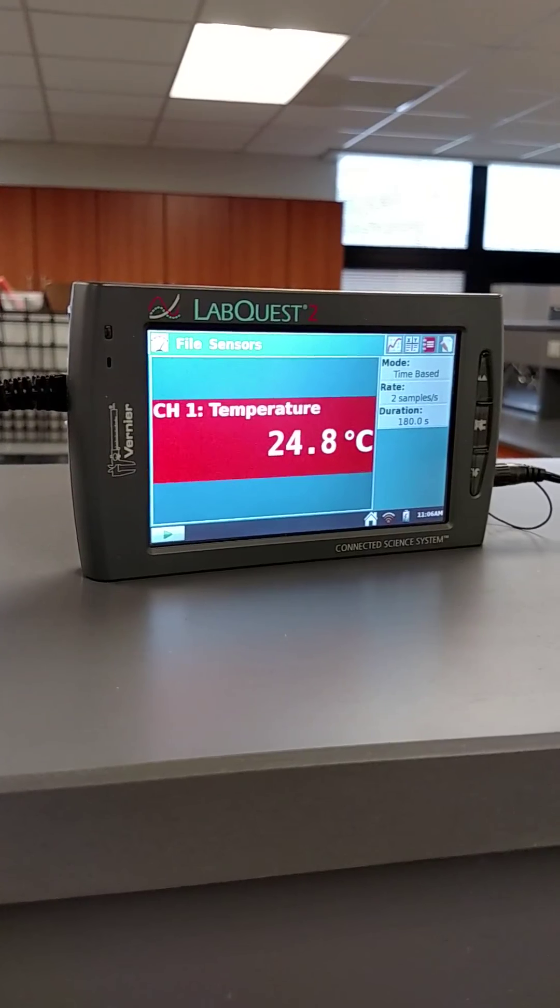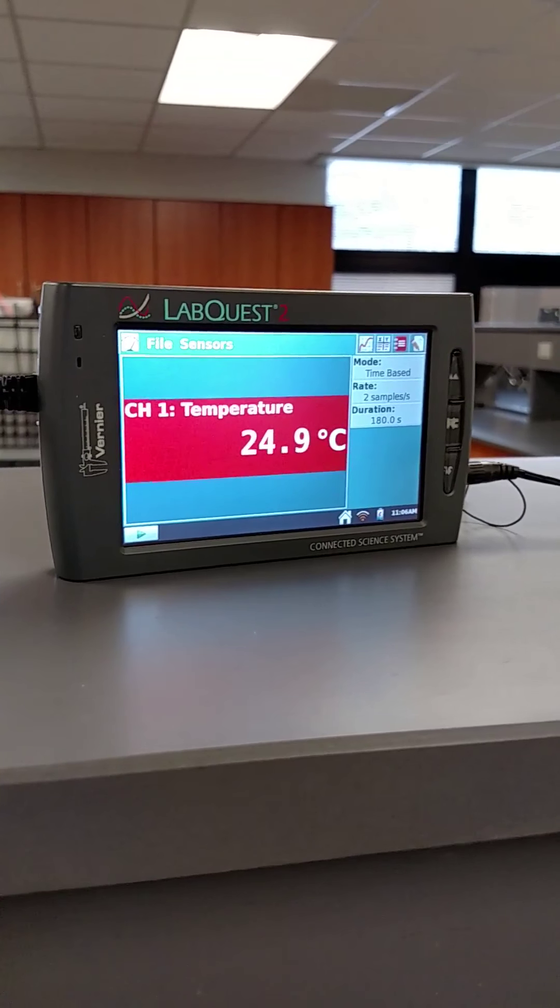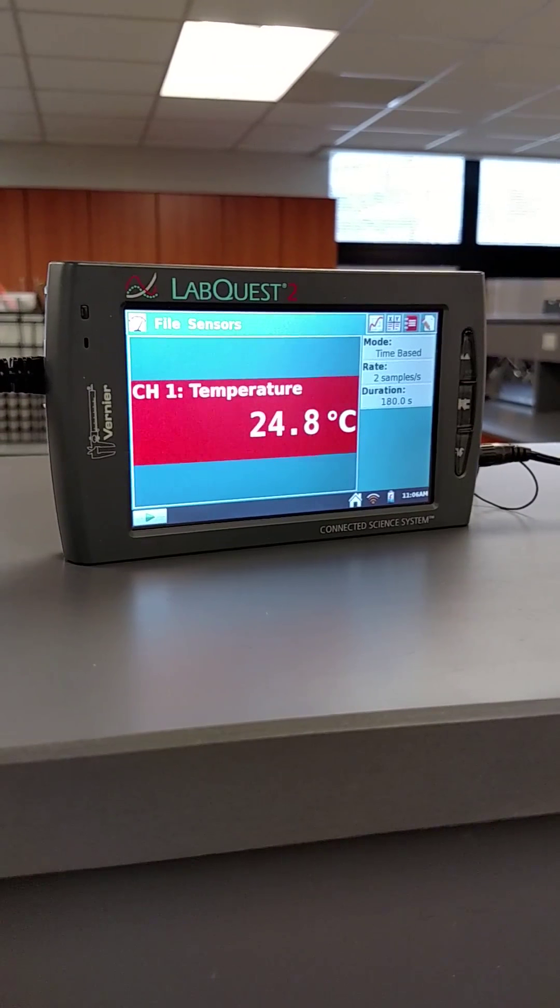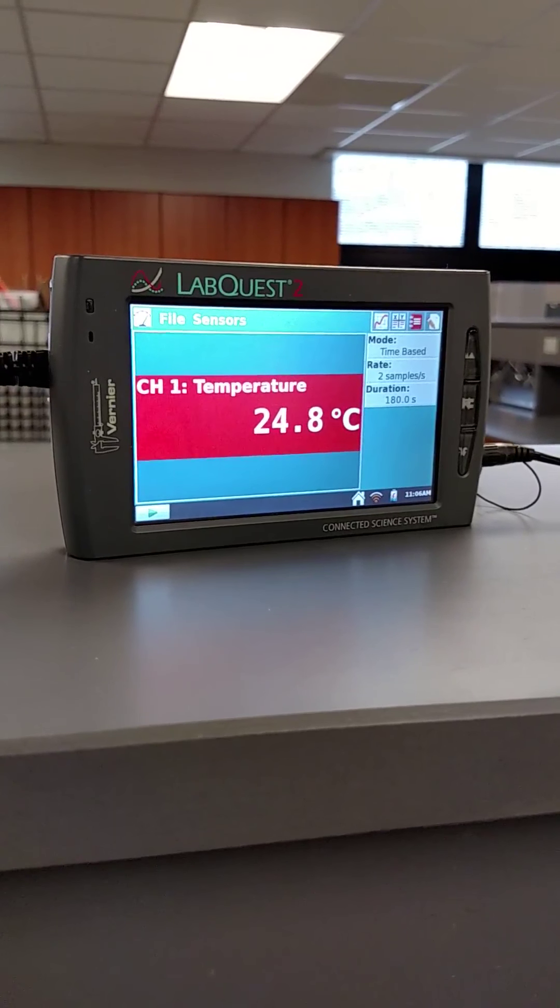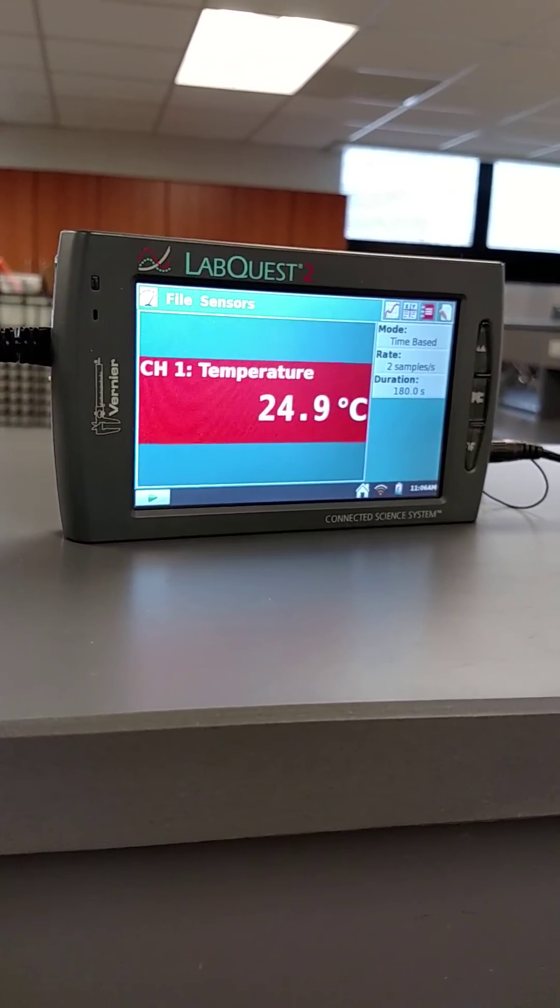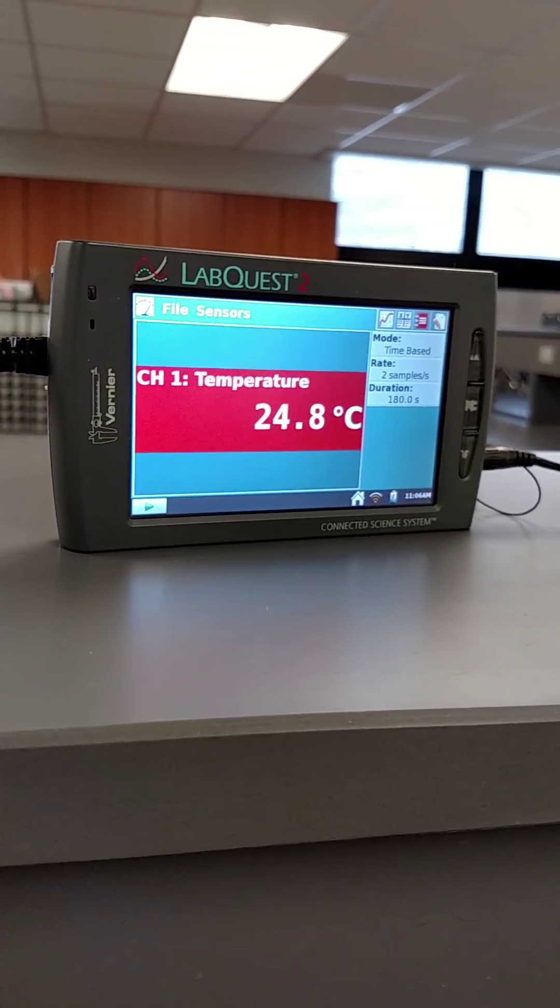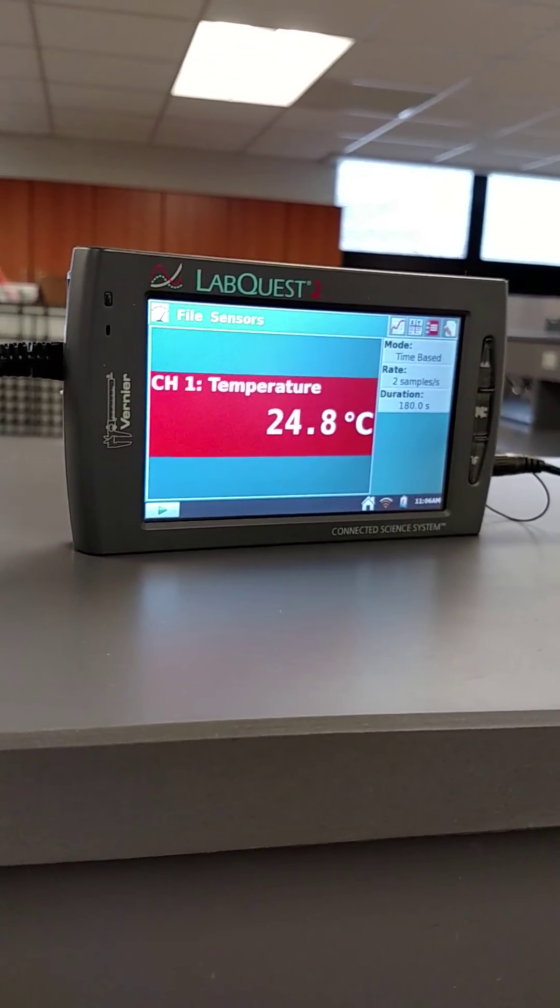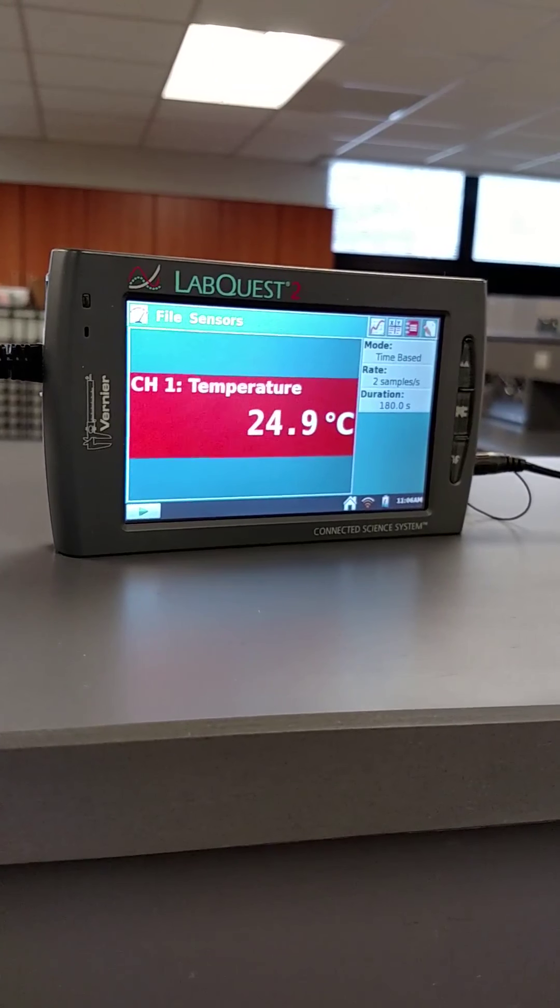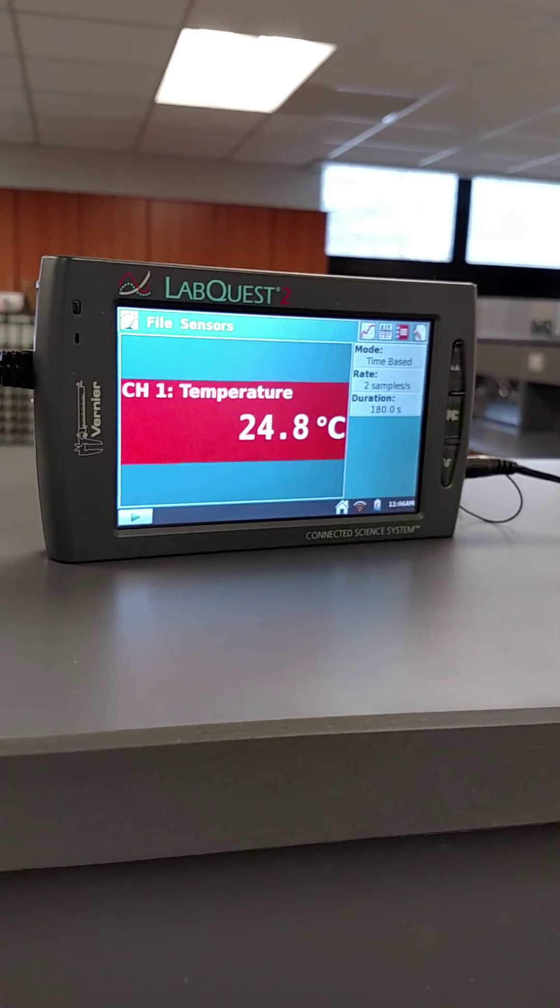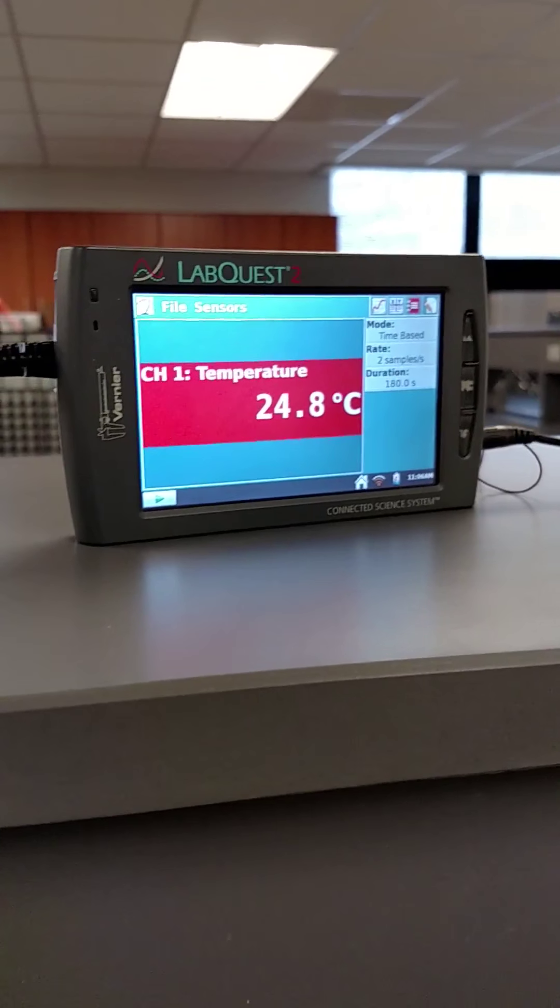24.8. Oh, hang on. One more time. Yeah, I'd like to call it 24.8. That's where it's most stable. And there you go.